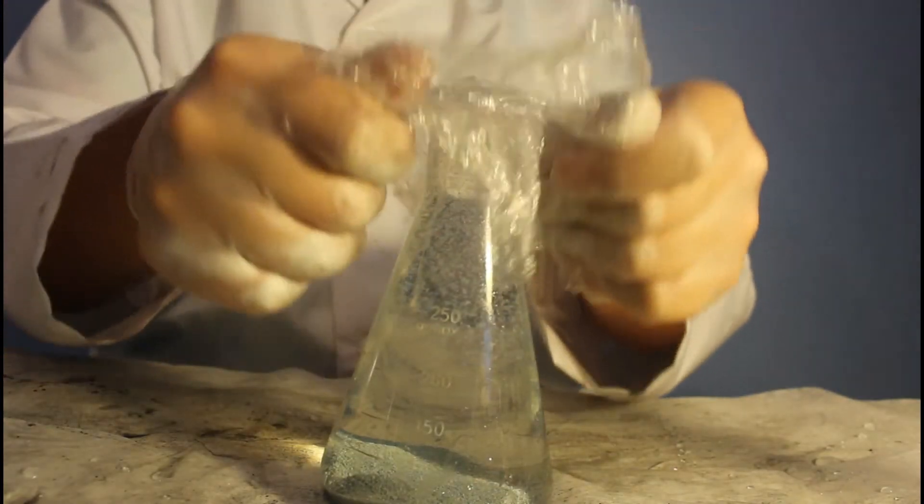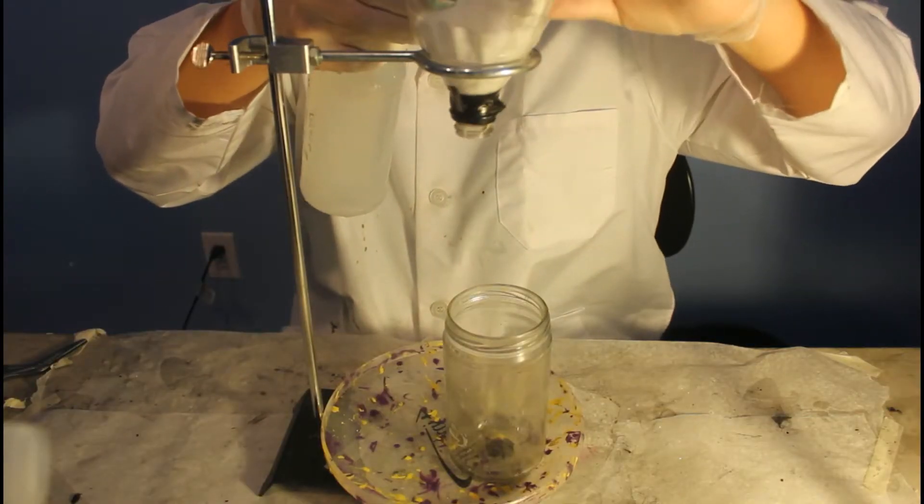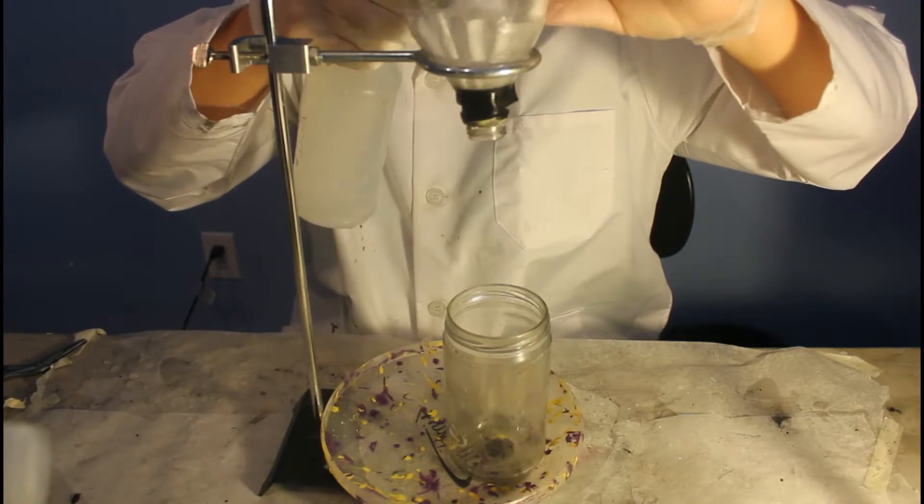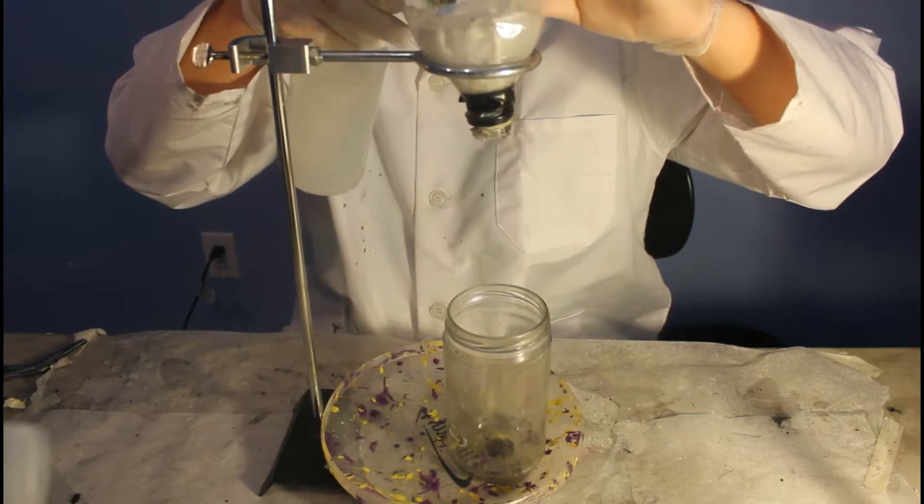The flask is then topped off with water, capped, and set aside for the filtration. The filtration is set up by suspending a funnel on a ringstand over a receiving beaker. A filter paper is added to the funnel and wet with a wash bottle so it sticks to the side of the funnel.